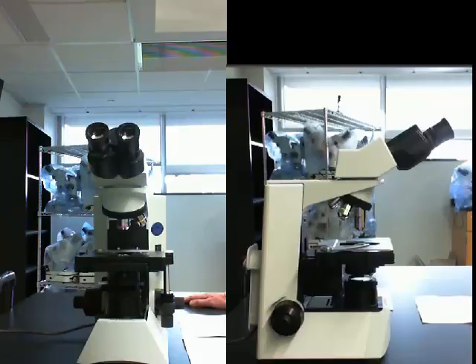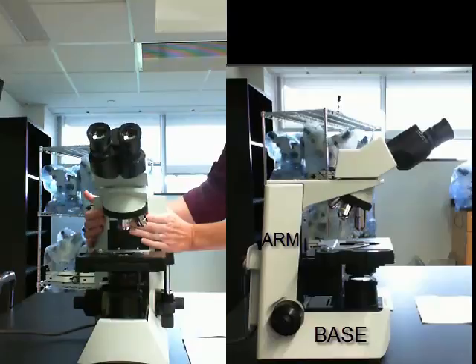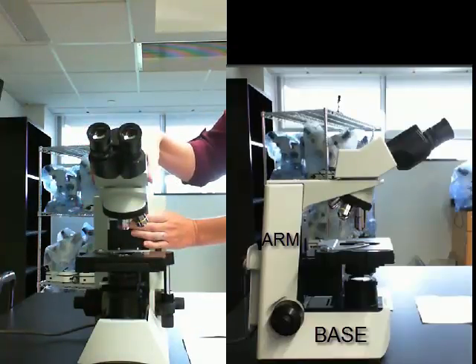The goal of this video is to provide some reminders and pointers on the use of a compound microscope. First, let's quickly review the major parts of the microscope. Let's begin with the base, which is the bottom part of this microscope here, and the arm, which is connecting the base to the head of the microscope.